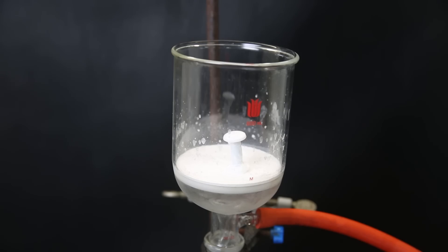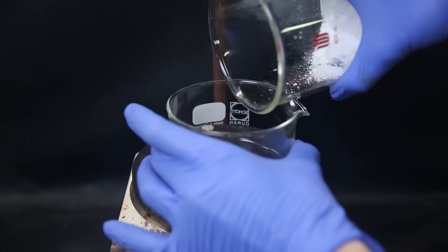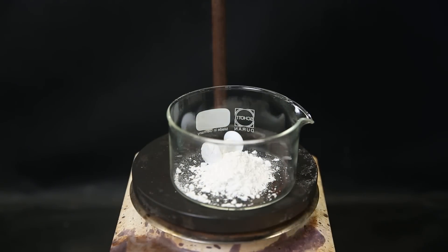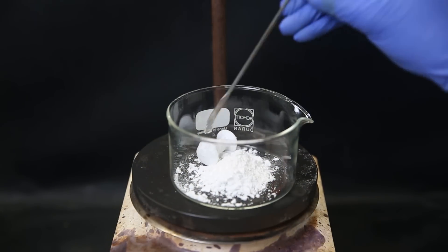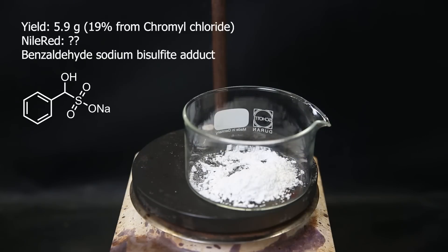I leave it to dry on the filter for a second so that the ether evaporates. I then move it all to a crystallizing dish. The yield of the bisulfite adduct turned out to be 5.9 grams, which is 19% calculated from the chromochloride. NileRed didn't say what his yield was. As a creator, I understand that he left out the yield. As a chemist, fuck you.